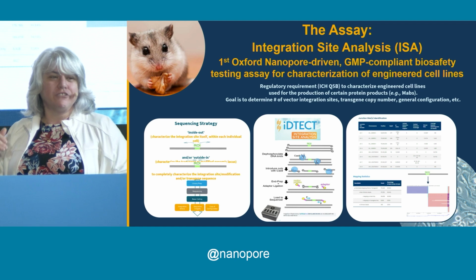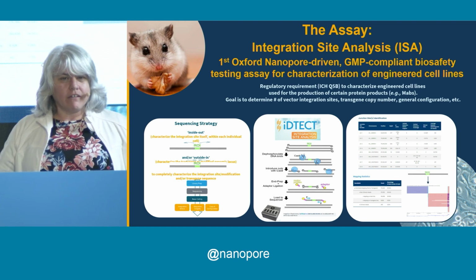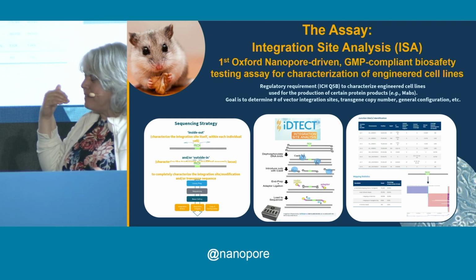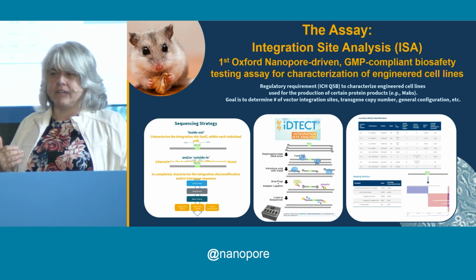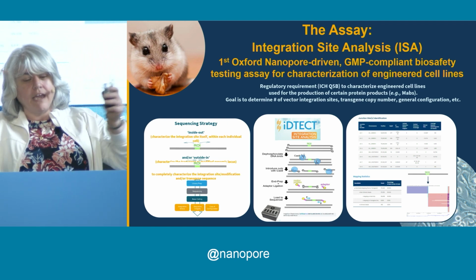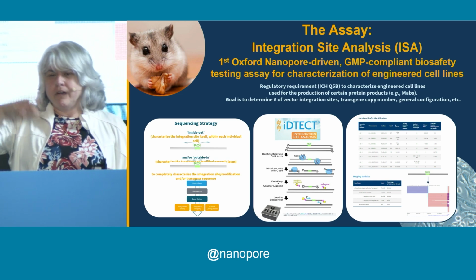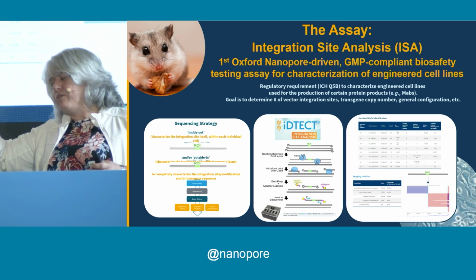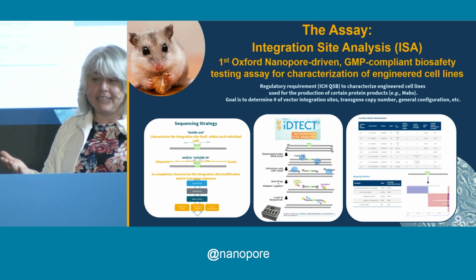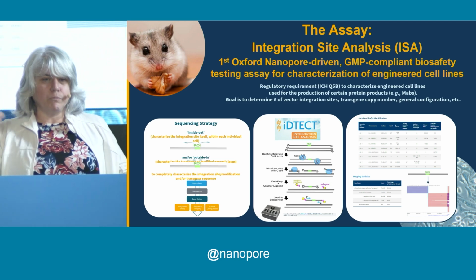Hamsters, all right, so CHO cells are great for production. They're great. You can get high titers. They're really well characterized. They've been used for decades, longer than I am old. They're great. They're horrible to characterize. Right, because their genomes, you look at the hamster sideways, and its genome goes, and it starts rearranging. And now it's not chromosome 1 anymore. It's chromosome 1 with a bit of chromosome 4 and some 7 thrown in backwards, and then they deleted this one. And you have to mine data and compare it to reference sequences. It's really hard to do when the thing keeps moving around.